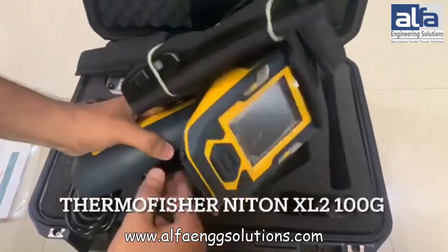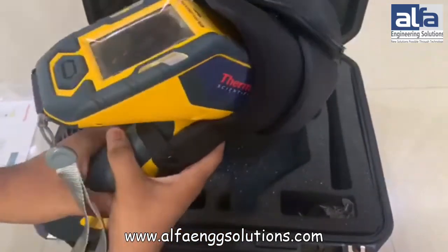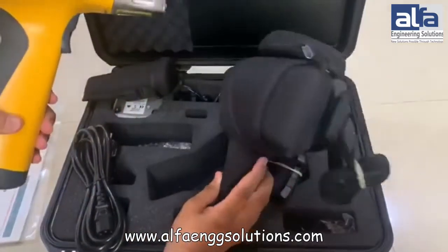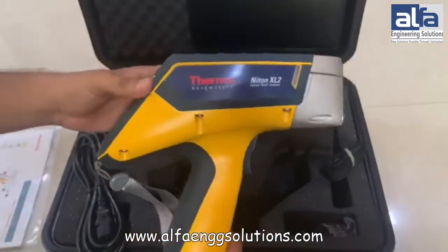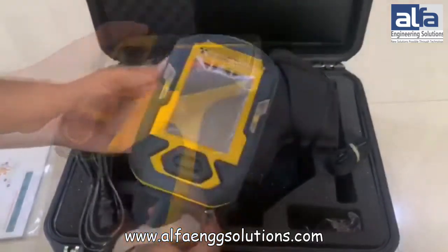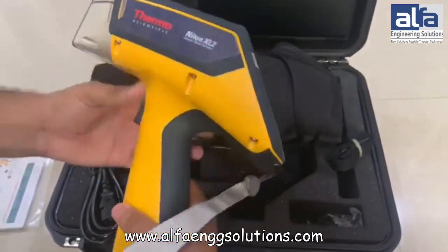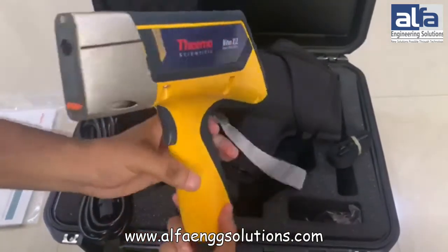This is the device, the Thermo Fisher Niton XL2 100G, which comes along with a protective case. This is the sensor through which all the metals are going to be analyzed. This is the display on which all the compositions are going to be displayed. There are some controls given to control the display, and from here we are going to attach the battery to the device.